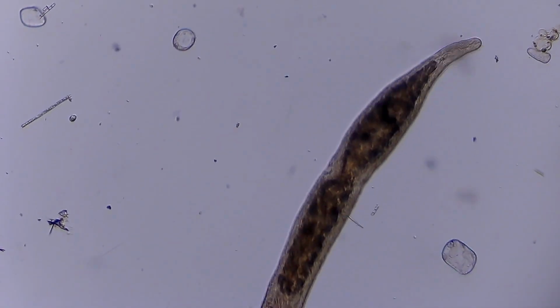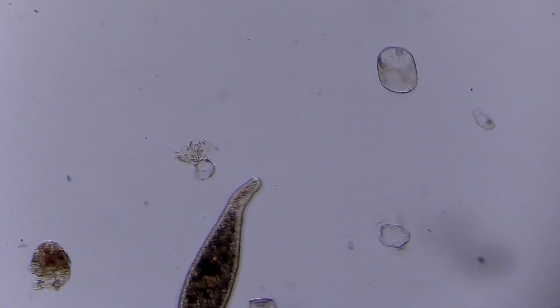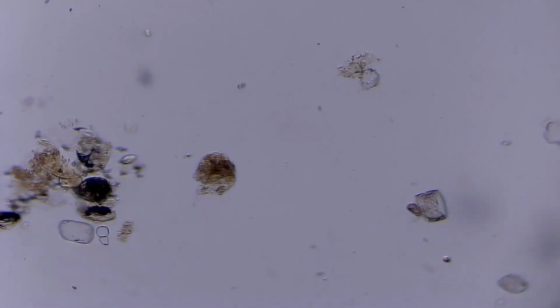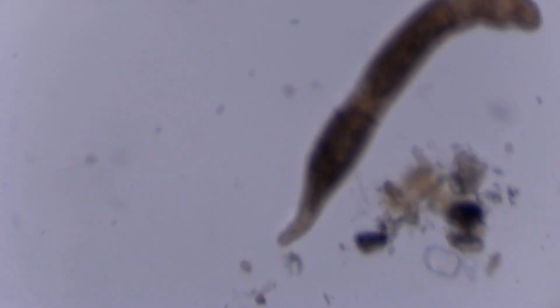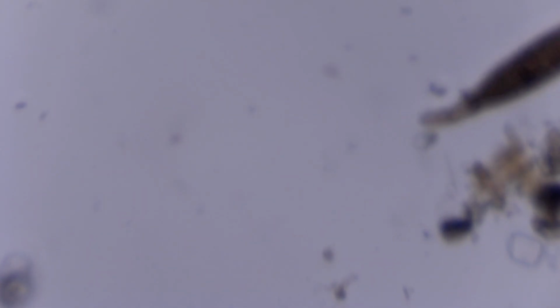I don't think it's a parasite per se, but it's definitely alive and it's moving and it's looking for a way out. Now, this was water that I got at the underside of a dying piece of dwarf water lettuce, so I knew there was going to be life there, eating the decaying stuff. That's normally where you find a ton of these microscopic organisms, just feeding on that. So I took a droplet of water from there, and this is what we're seeing, which is incredibly interesting.